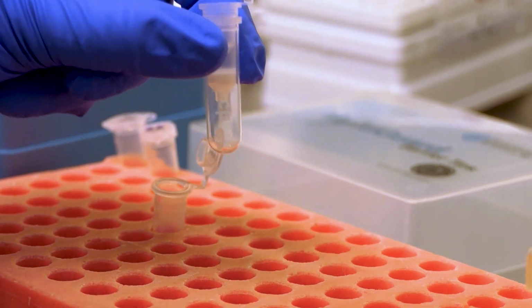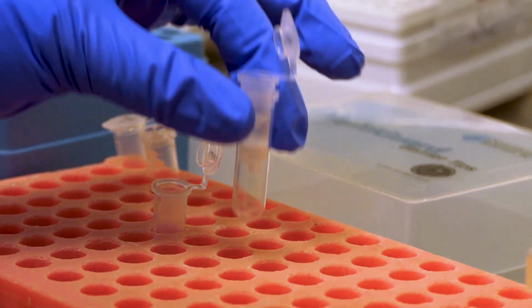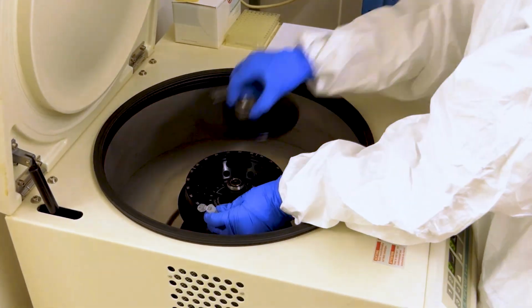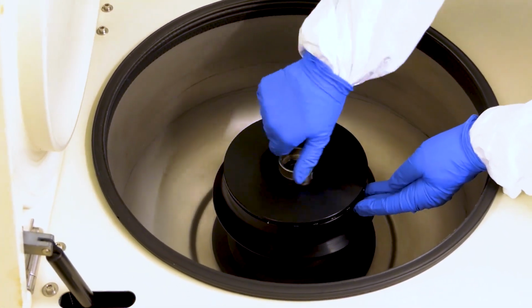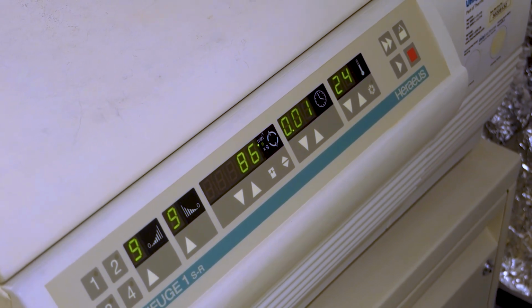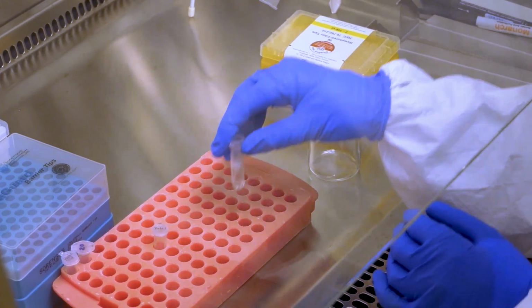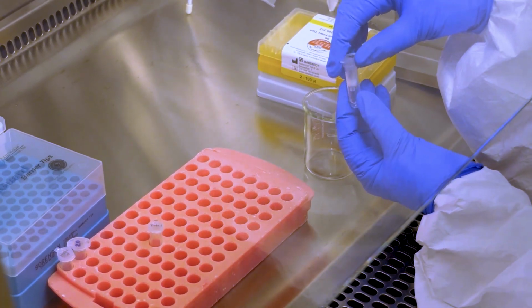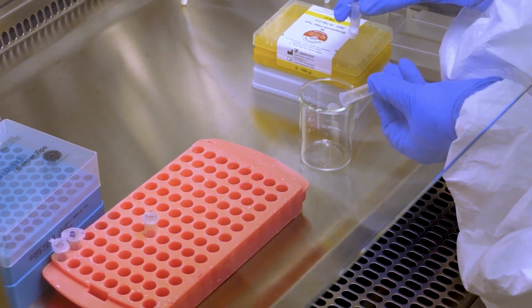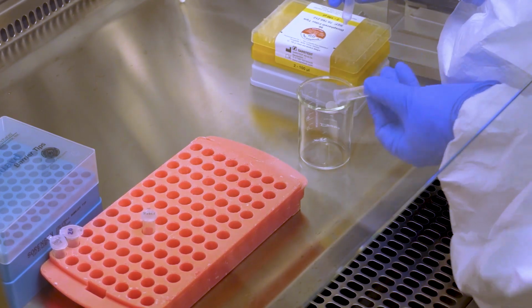While spinning down the sample, the DNA is bound to the silica gel. Make sure to keep a low velocity while doing so, as described in the protocol. Otherwise, you may lose your sample. Spin for 1 minute, then discard the flow-through. Take care not to contaminate the column with remaining drops of flow-through after having discarded this.